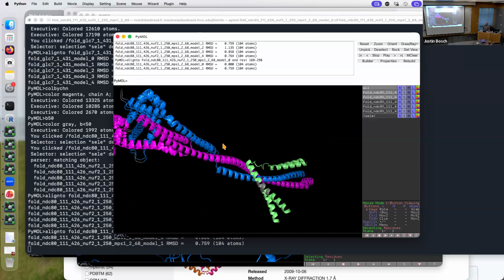I think that's about all I want to say on PyMOL. I know that's a whirlwind tour. On the YouTube channel, there is a 2-hour lecture from the beginning of the pandemic about how to use PyMOL. So all of these things plus a whole lot more.